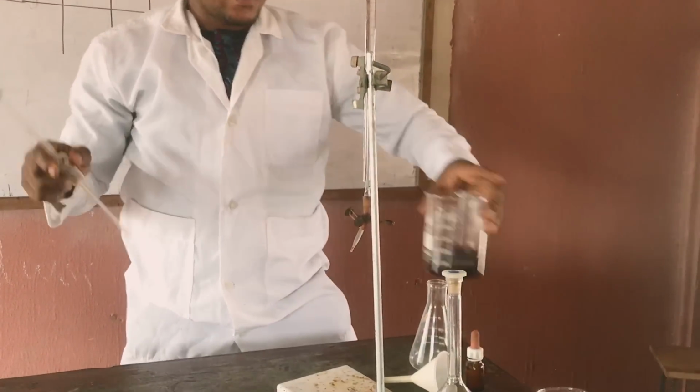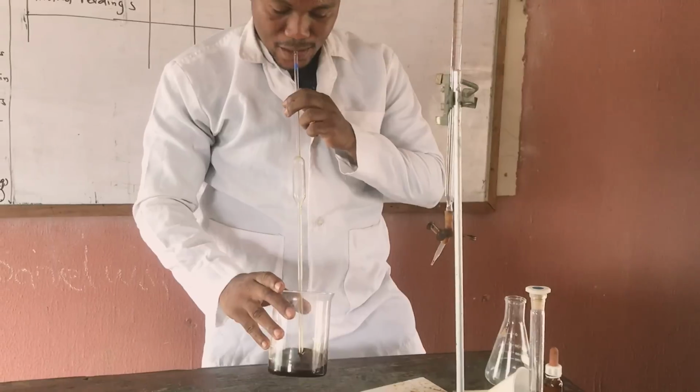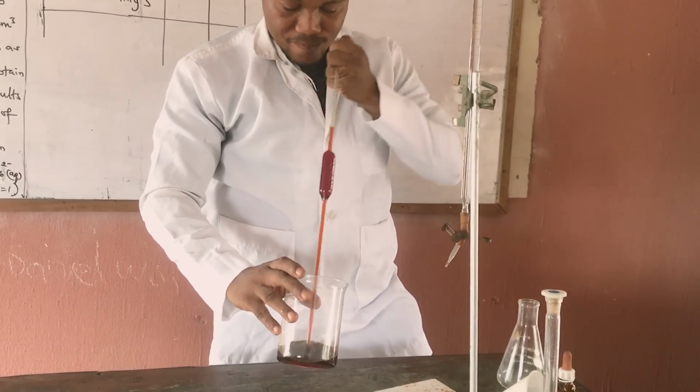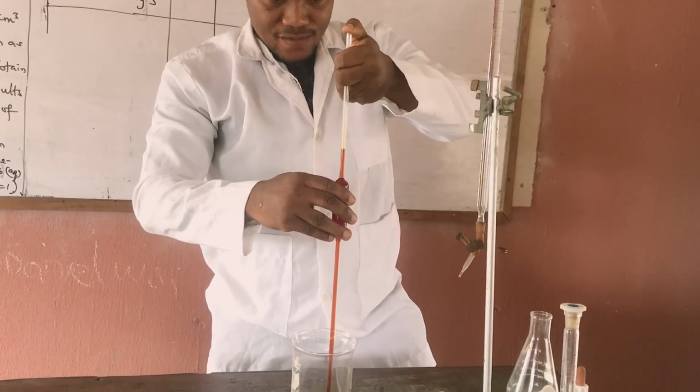So this is my iodine solution already prepared. So let me pipette. So let me pipette this.